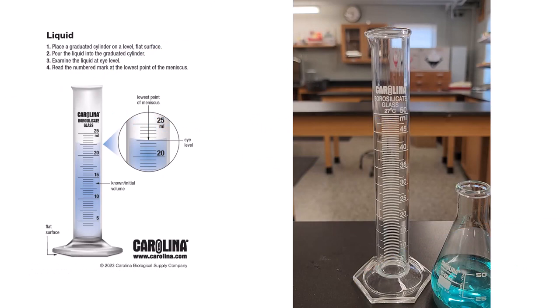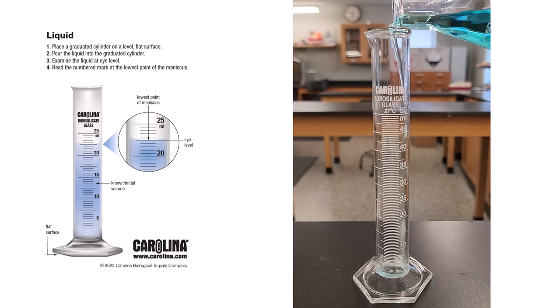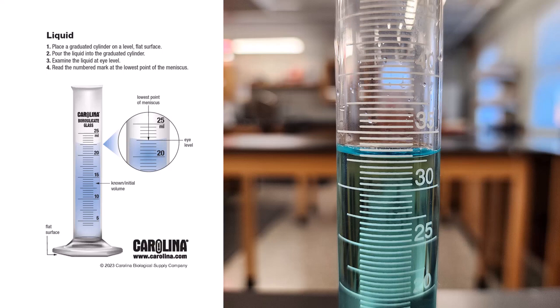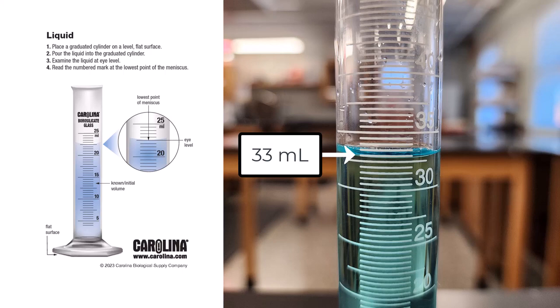To measure the volume of a liquid, you will need a graduated cylinder. Select a graduated cylinder of appropriate size. Place the graduated cylinder on a flat, level surface. Pour the liquid into the graduated cylinder. Examine the liquid at eye level. Read the numbered mark at the lowest point of the meniscus. In this example, the lowest point of the meniscus is at 33 mL.